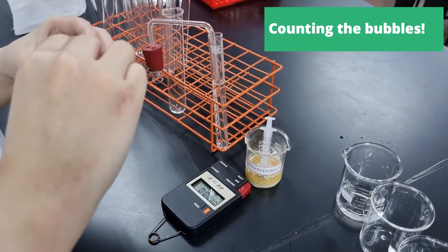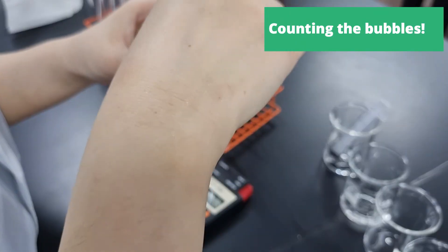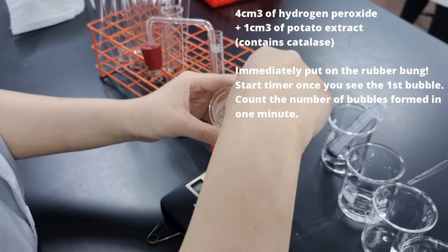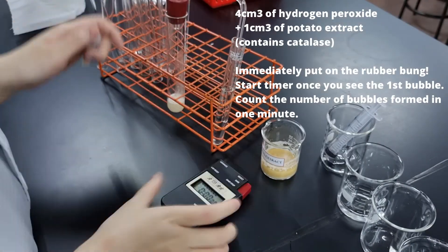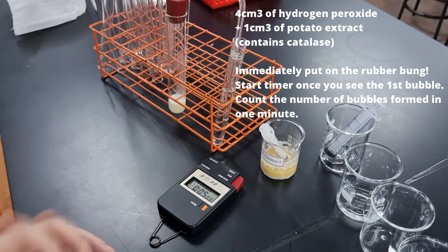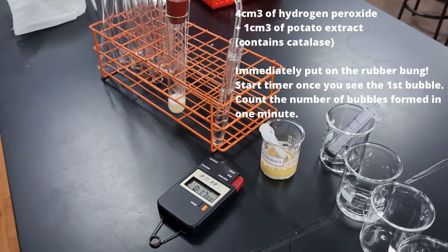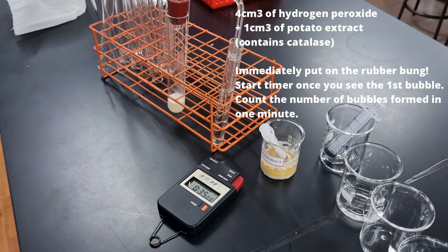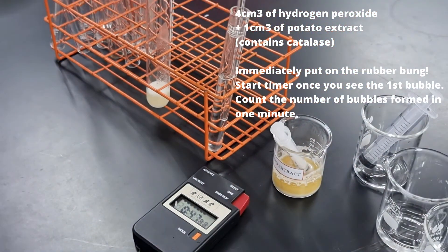After the concentrations are prepared, we add 4 cm cubed of the substrate, which is hydrogen peroxide, into a boiling tube, and then add 1 cm cubed of potato extract if contains catalase. And we put the bung on, and it's connected to a delivery tube. And as you can see, the delivery tube is then connected to a test tube with distilled water. And we count the number of bubbles produced in 1 minute.